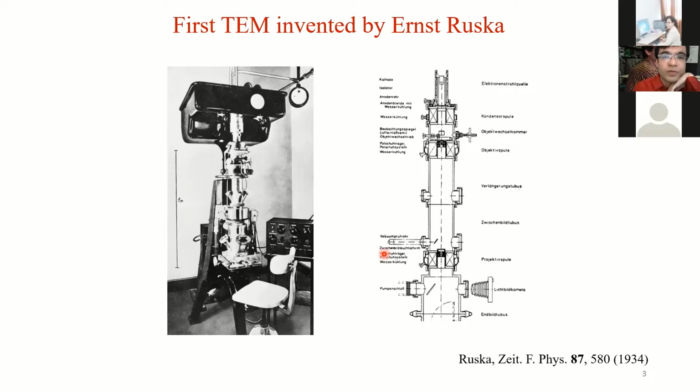And here, first it was Ruska who invented the first transmission electron microscope. At that time, he was unaware of the wave-particle duality, because unlike today, we didn't have so many resources like the internet. So he was totally unaware of the wave-particle duality, and while he was working with a cathode ray oscilloscope, he just invented the transmission electron microscope.